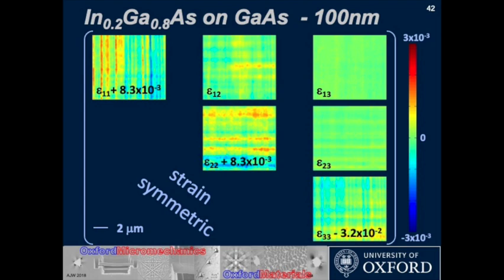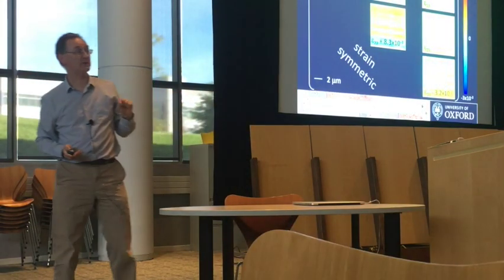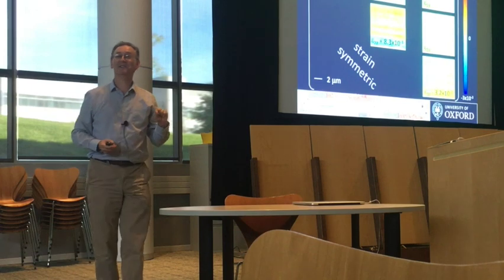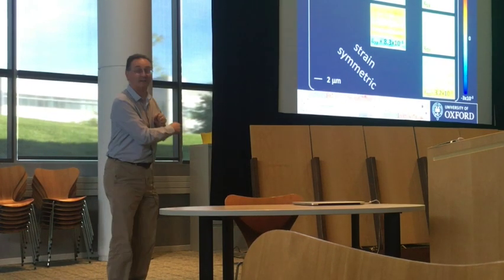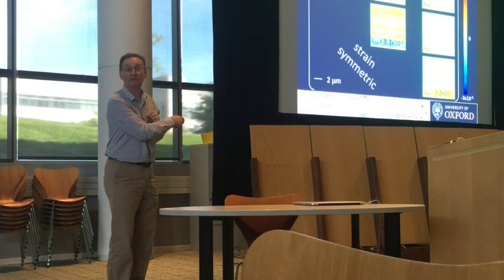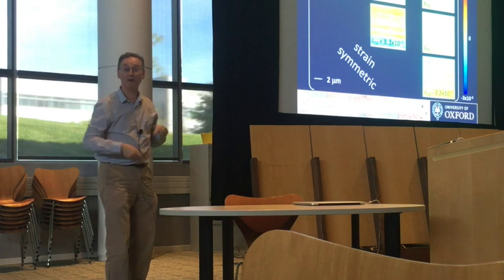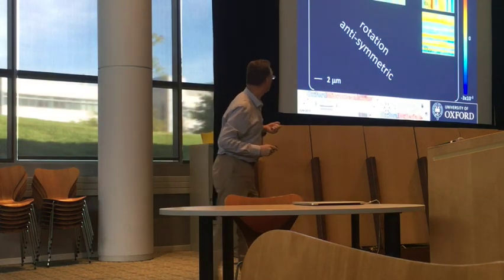Okay. You can also see, though, that there's some shear term in there, and that implies actually that there's some screw component to those dislocations as well. If you look at the individual dislocations, they're 60-degree dislocations, but you can see it here that actually they're paired up to remove some of the screw-type nature, but to force up the edge-type nature.